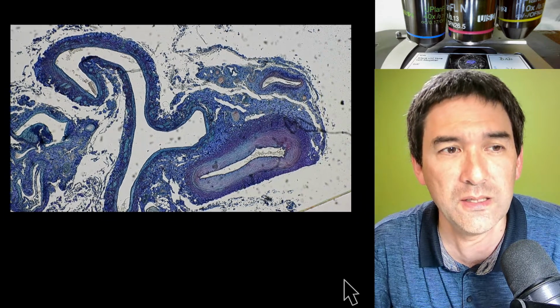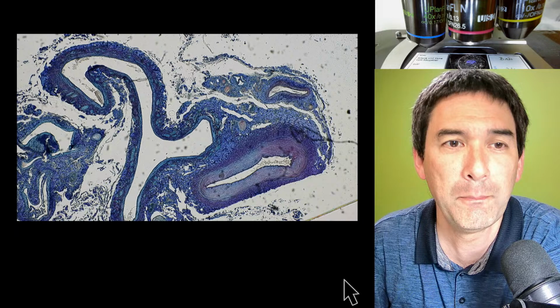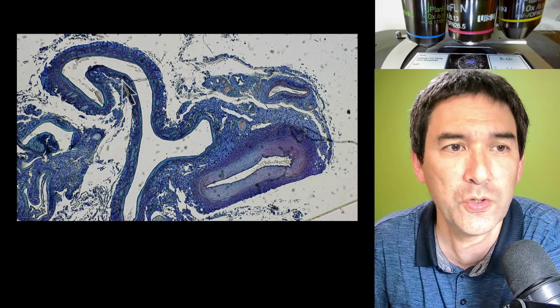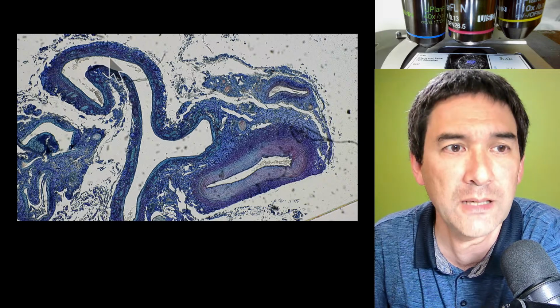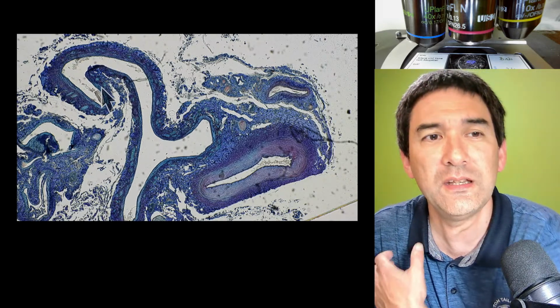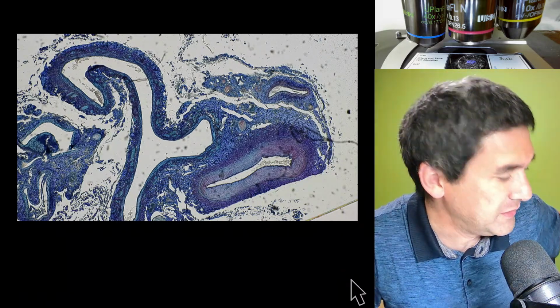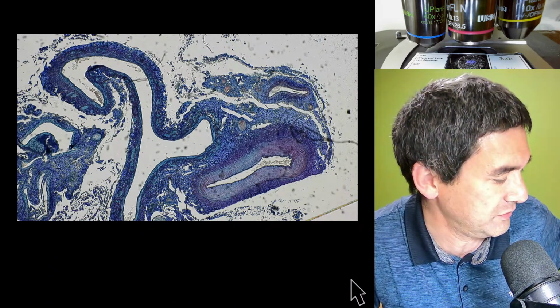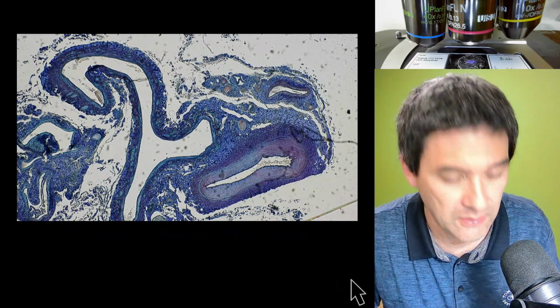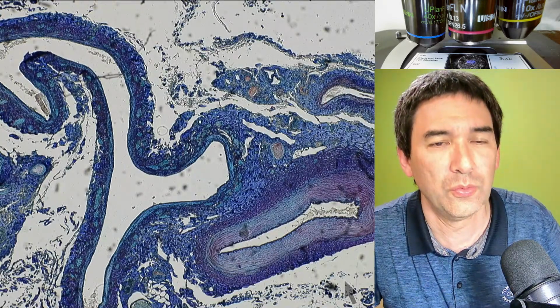This is basically the full image that the microscope camera delivers. Yeah, but maybe you are going to have a camera system which, at the same objective magnification, only produces a smaller region from the center. Right, so you see, this is why the whole issue with magnification is a rather difficult thing for comparison, right? So what I have done, let me just make this again. Yeah, return this back to the original one here.